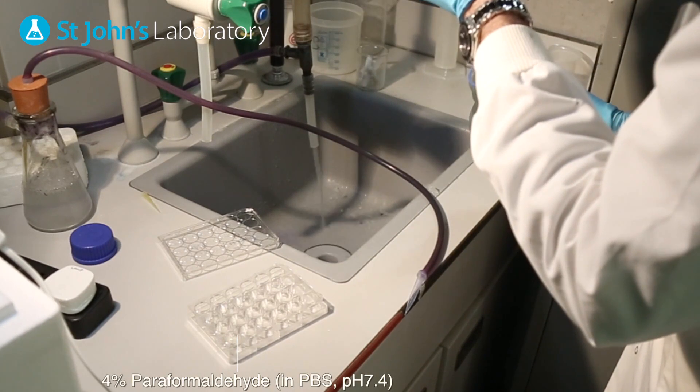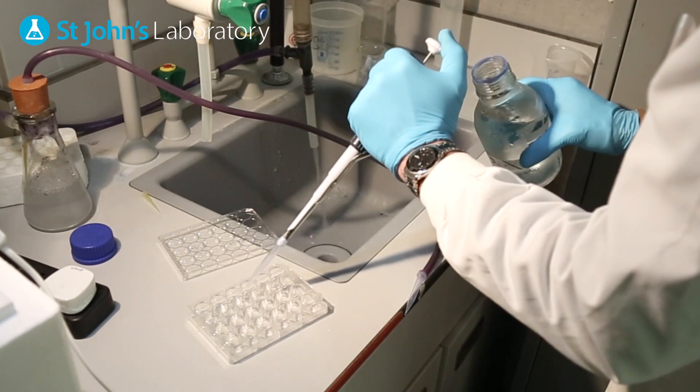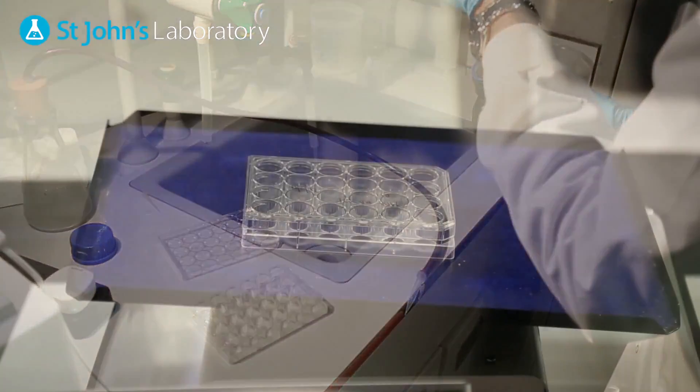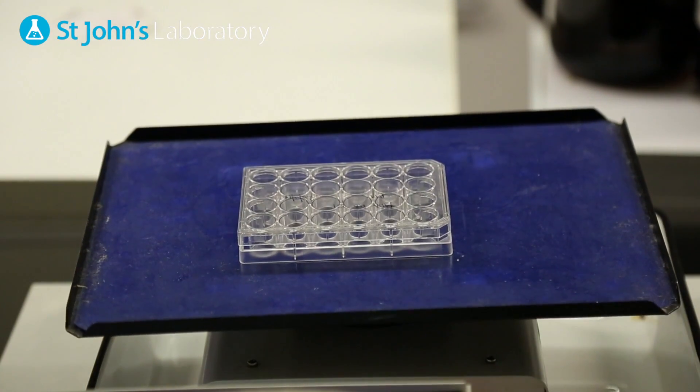Using a pipette gently dispense 4% paraformaldehyde down the side of each well. Ensure not to disrupt the cell monolayer and incubate for 20 minutes.